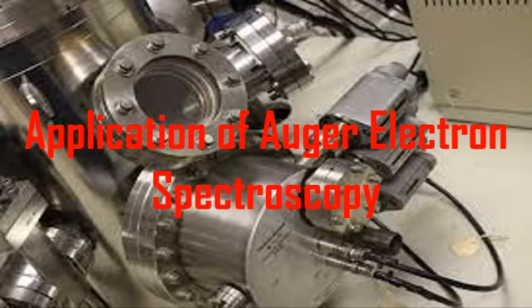So Auger electron spectroscopy determines the average composition or average variation of composition if present on a substrate, and even very small compositional variation of the thin film. Similarly, Auger electron spectroscopy has a wide range of applications. Now let us discuss a few applications.